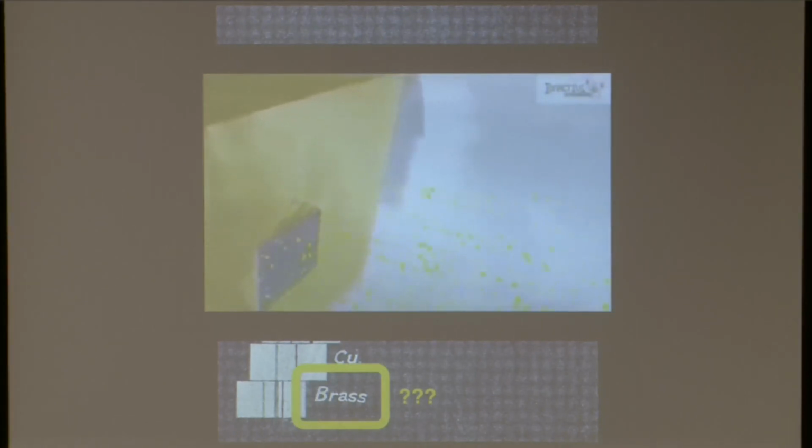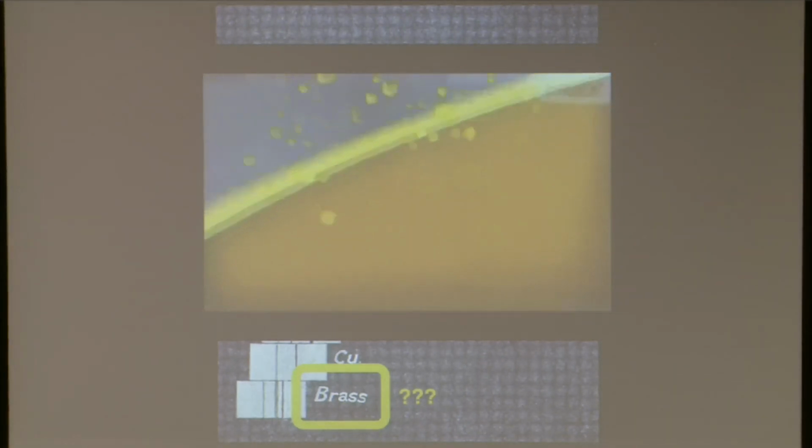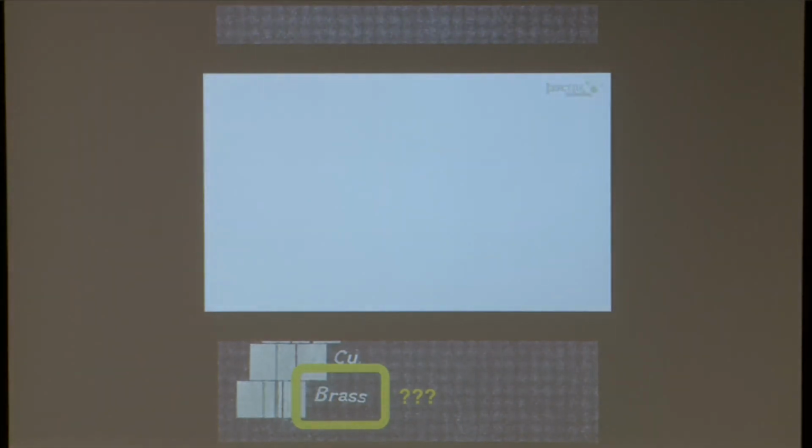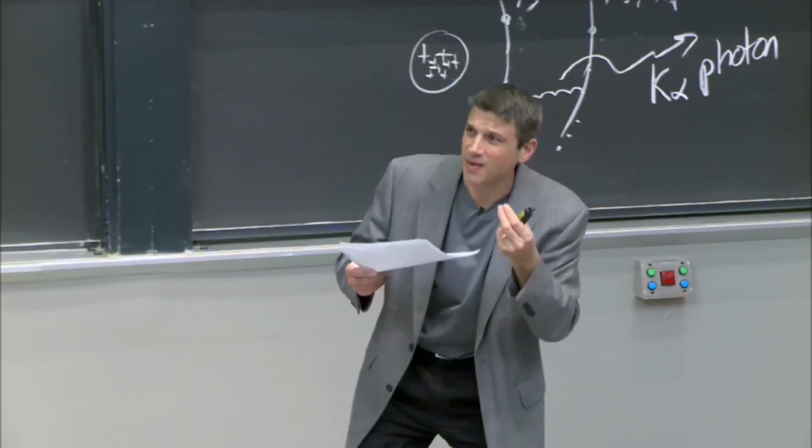The target is typically a piece of tungsten or molybdenum, which may be embedded in a stationary water or oil-cooled rod, or on a rotating disc. The high-speed electrons collide with the target and rapidly lose energy. There are two X-ray producing interactions between the incident electrons and the atom.